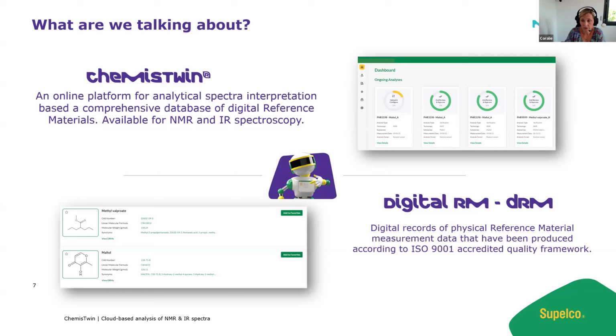And we've built that concept of digital reference material that we launched about 3 years ago. The way we define digital reference material is a digital record of a physical reference material that has been produced under ISO 9001, and of a physical product that is sufficiently pure and sufficiently characterized. So we still want for these DRMs in our definition a clear link between a physical, highly pure, well-characterized material and a reference data set that we obtain from that material. This is important. Ultimately, later, we also want to move to data sets that could be purely simulated.